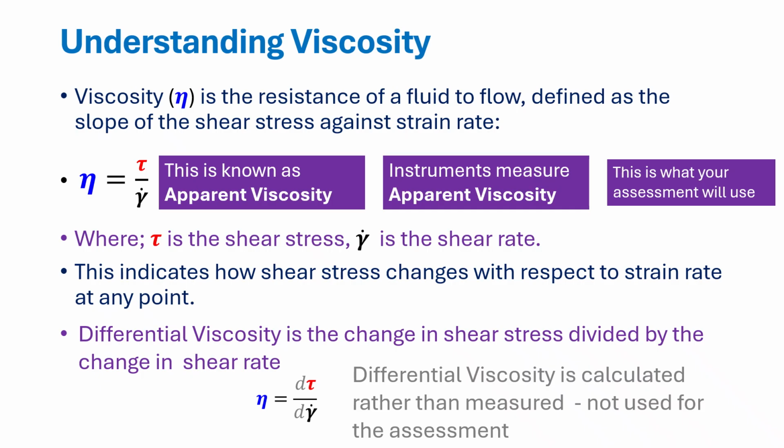This differential viscosity is calculated rather than measured. It's not going to be part of this assessment. It's not part of the practical. It's unlikely you're going to come across it further at the moment, but be aware it can catch you out if you start looking at a textbook, and that's why I try and make you aware of this, so that that language does not confuse you.